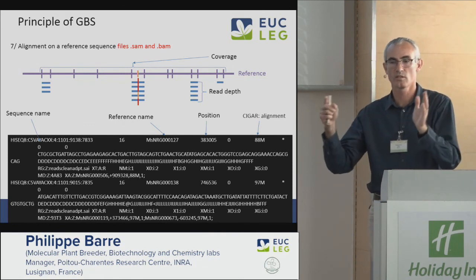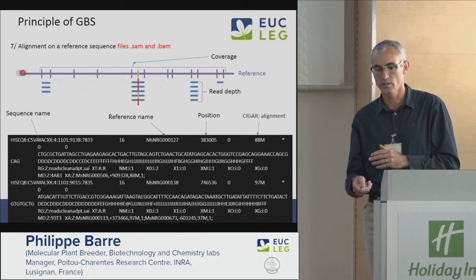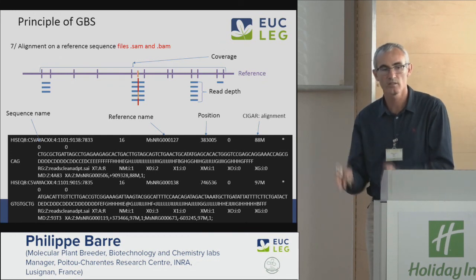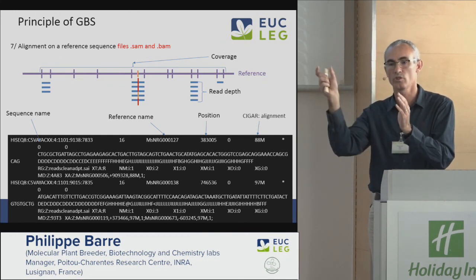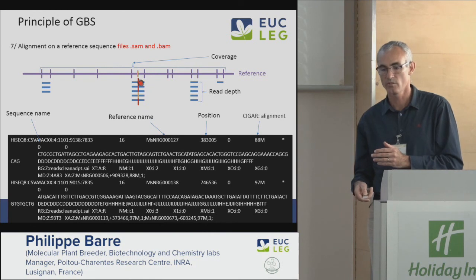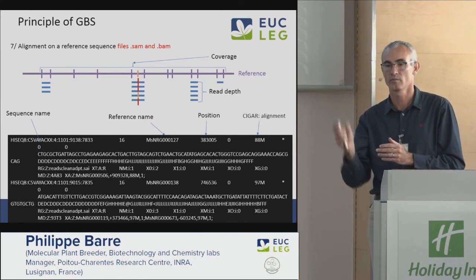You align the sequences against a reference sequence, look at the homology, and say, okay, this one fits here, this one fits here, etc. And you see for one locus here, you have several reads.